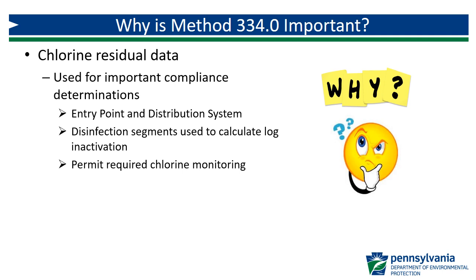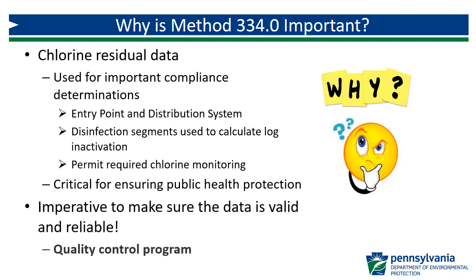All systems that use a chemical disinfectant need to monitor disinfectant residual in the distribution system in order to show that they are maintaining the residual throughout the system. In addition to maintaining compliance with regulatory requirements, maintaining disinfectant residual is critical for ensuring public health protection and customer confidence. Since chlorine residual data is used for such a variety of purposes, it is imperative that the data water systems collect, report, and use for process control decisions is valid and reliable data, and the way to ensure the validity of data is to follow a rigorous quality control program.